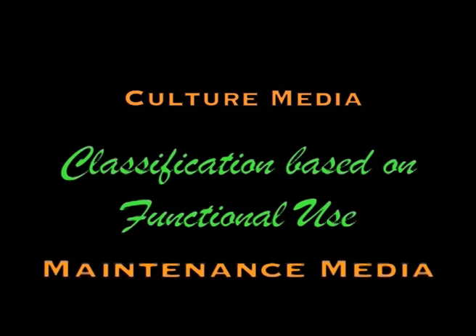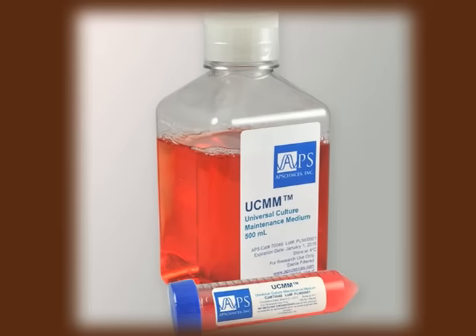The other kind of medium is maintenance medium. The maintenance medium, as the name suggests, is generally used when the microbes only need to be maintained in the lab. They do not enter the growth phase, but they only need to be maintained. These kinds of medium generally omit the use of glucose.